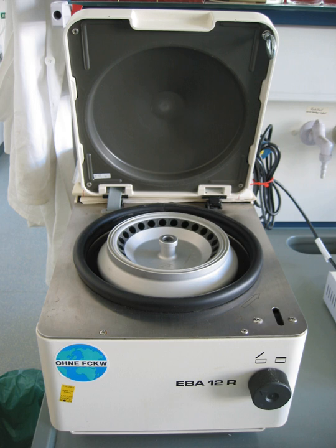Centrifuge rotors have tremendous kinetic energy during high-speed rotation. Rotor failure, caused by mechanical stress from the high forces imparted by the motor, can occur due to manufacturing defects, routine wear and tear, or improper use and maintenance. Such a failure can be catastrophic, especially with larger centrifuges, and generally results in total destruction of the centrifuge.